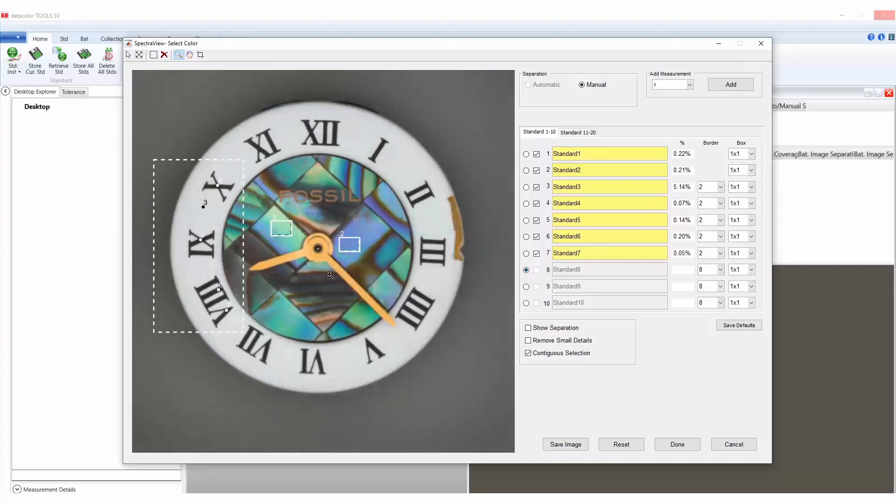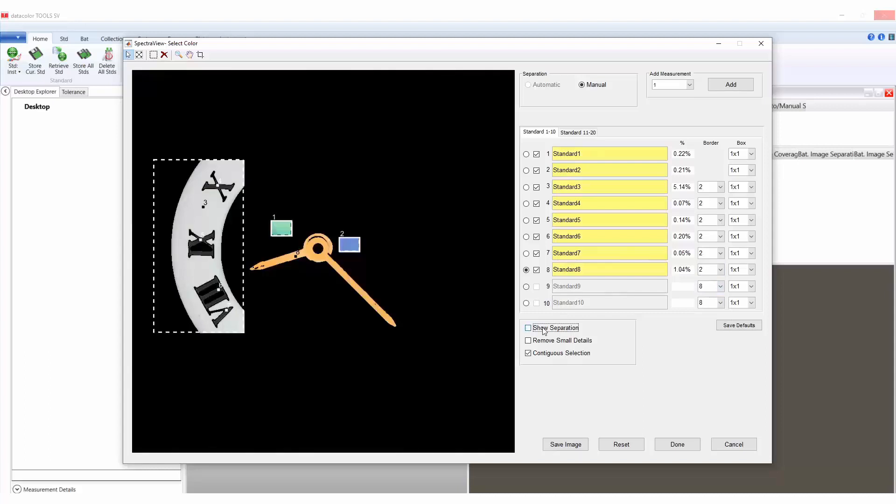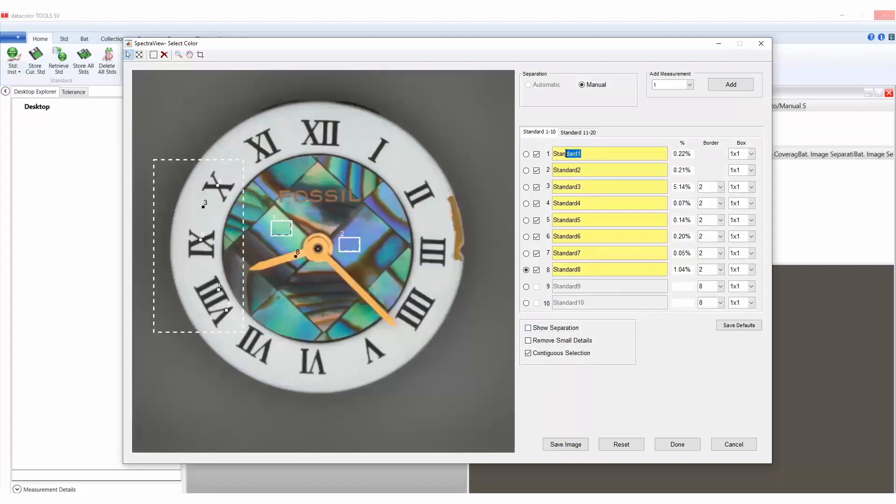Select the watch hand by clicking on an area within the hand, then adjust the border to border size 2. Review the selections by selecting show separation. Once the selections have been completed, the user will rename the selections if desired or change the borders per individual colors. Press done when finished and the individual batch measurements for all colors will populate to the desktop. The user can then determine whether they want to store, evaluate, or export the data.